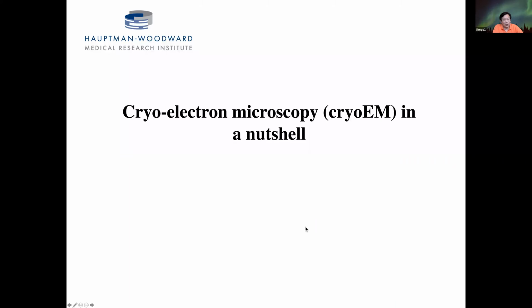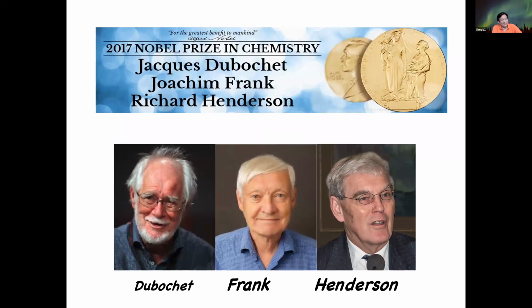First, I will give you a brief introduction about cryo-electron microscopy, or Cryo-EM. So Cryo-EM has been a technology for structural biology since the 1960s, actually.